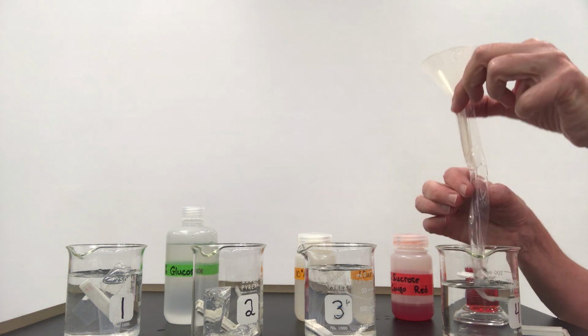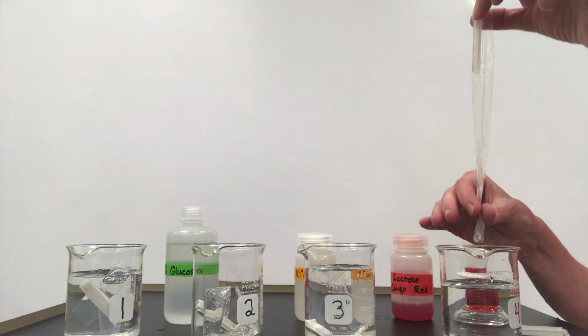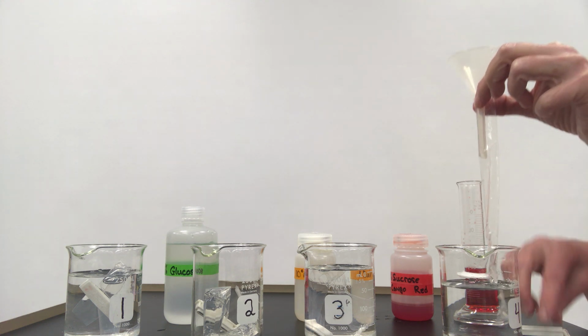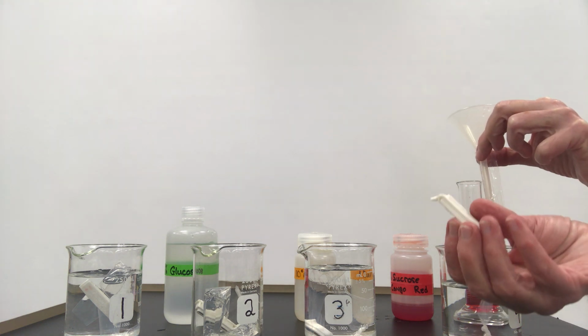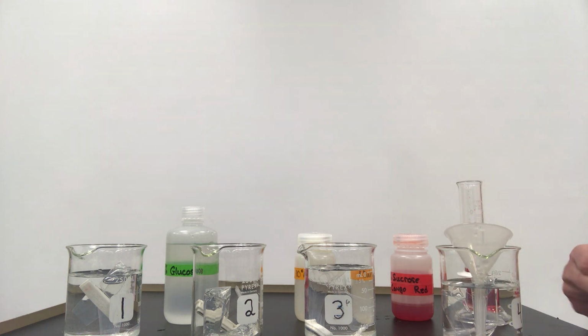And you can look at this. This is a piece of dialysis tube that is deflated at this point, has nothing in it. We've tied off one end. We're going to fill it with a solution, and then we're going to clamp the end with this little barrette clamp, and we're going to leave it in another solution surrounding it. We're going to set this up with 4 different beakers.